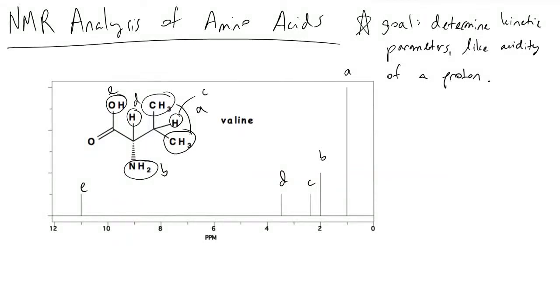To follow up with our analysis of using NMR to examine biomolecules like amino acids, I would like to talk about how we can now use something referred to as D2O, which is a water molecule, but instead of protons, it has deuterium atoms, which is just a proton, but with a neutron. And the thing that's cool about D2O is that it doesn't show up on high field NMR.